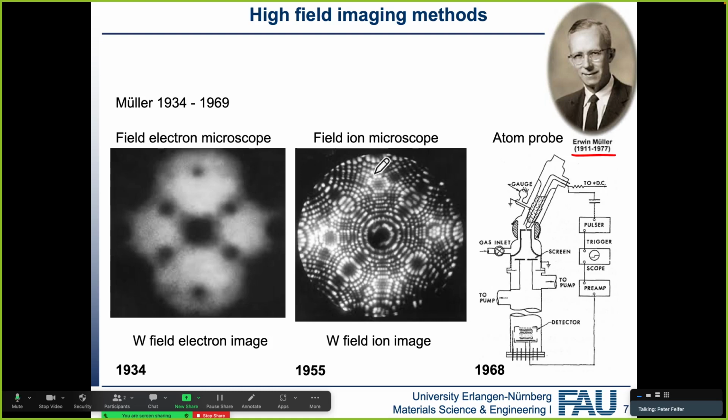The reason why they didn't see a clear image like this one is because at the time they didn't have image intensifiers that are as good as ours that we have right now. We'll talk about them later on, so-called microchannel plates, so that they had to have very long exposure. So essentially you had to sit in a dark room for an hour to accommodate your eyes to the very faint image that you get before the image intensifier plates came.